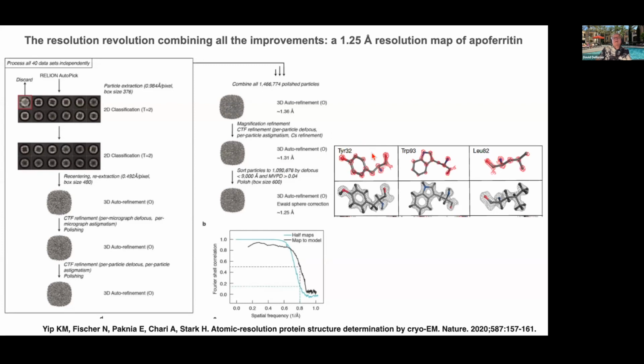And here is a high threshold cutoff, which shows that you can actually detect atoms. These little red things are, of course, the atoms in the selected amino acids. And here is the lower cutoff to show you what people are more conventionally seeing. It's absolutely stunning. And of course, it has turned structural biology on its ear.